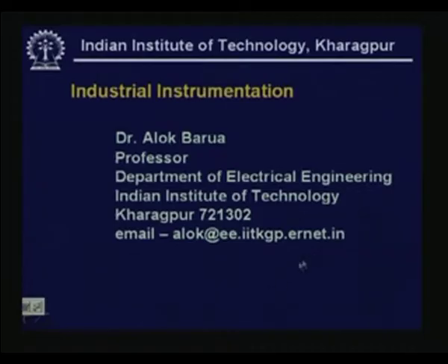Welcome to lesson 35 of industrial instrumentation. We will start to discuss chromatography. In general, we call it gas chromatography, as it is more popularly known, but it is actually chromatography, because chromatography is for both gas and liquid. So in this lesson and the subsequent lesson, lesson 36, we will consider gas chromatography. Let us look at the contents of lesson 35.